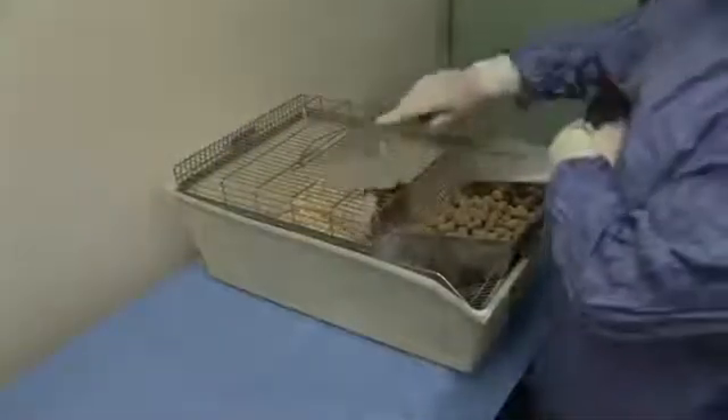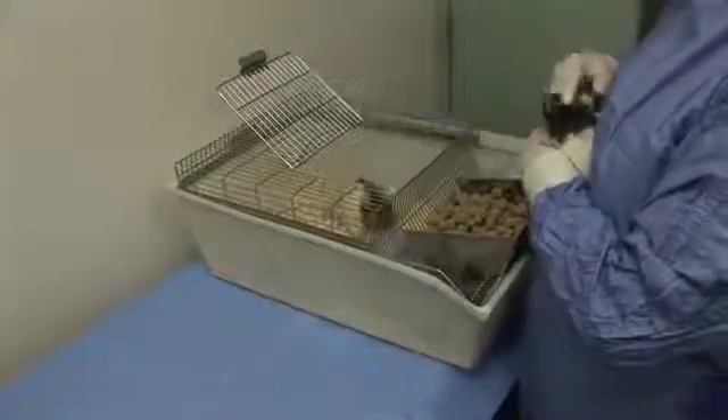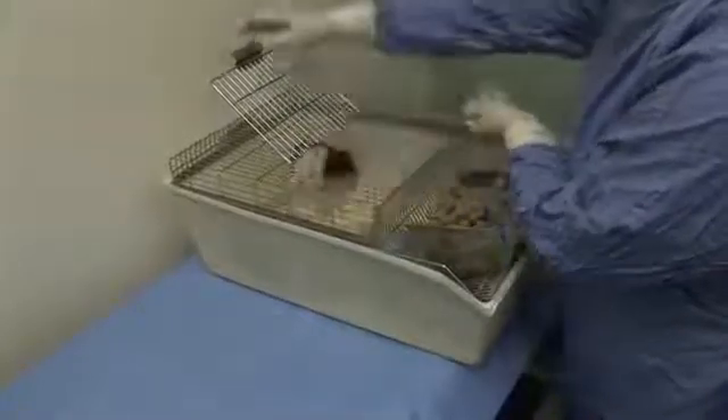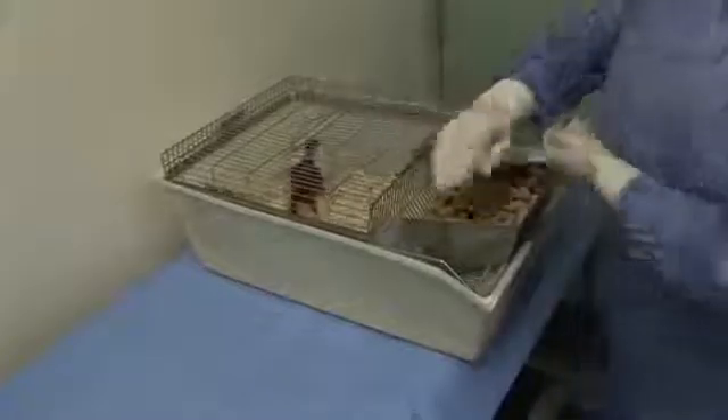Prior to release, it may be identified, for example with a tail mark, to confirm that the injection has been administered. When releasing the rat, maintain a secure grip until its feet have made contact with the cage floor, then gently release it.